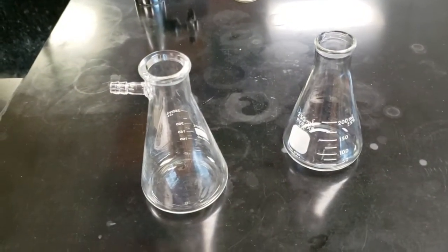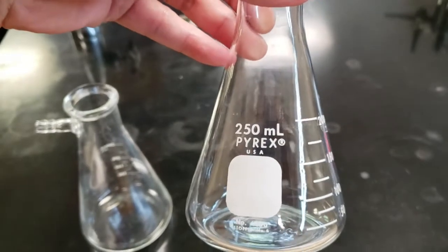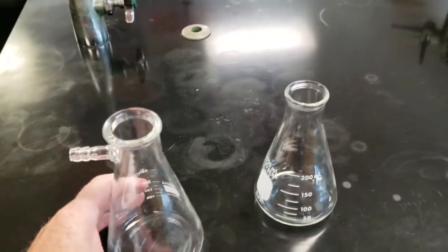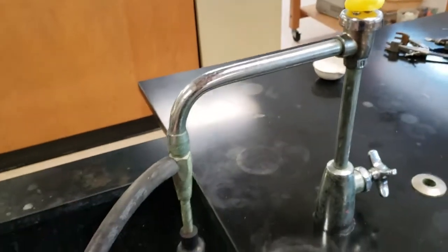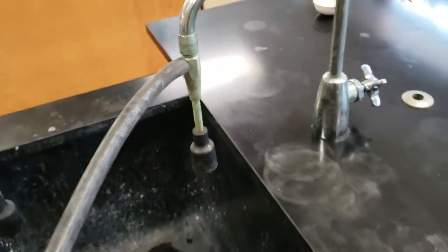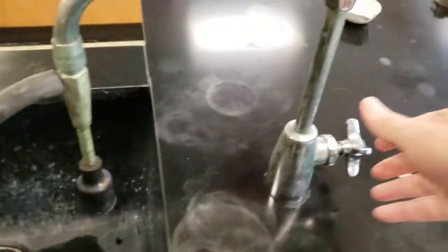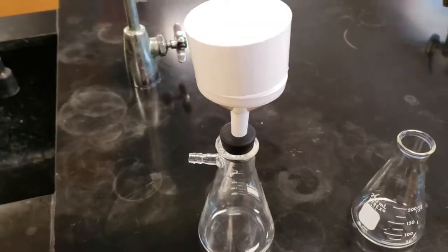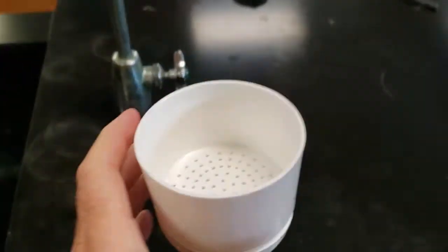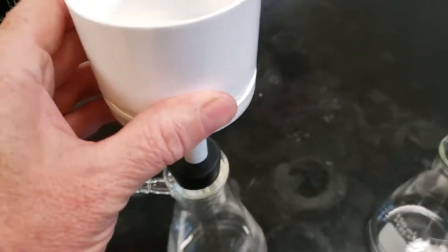These look alike, but they're not. The one on the right is an Erlenmeyer flask, spelled with four E's, also called a conical flask. It's a 250 here. This one is called a filter flask. It looks pretty much like an Erlenmeyer flask, but there's a glass spigot off to the side, which can plug into this rubber hose attached to the faucet. Once you attach it and turn the water on, it causes a vacuum inside the glassware. And then the top will be a filter. So this is a plastic filter for it. The filter lays flat, and it needs to be the same size as that. Once you pour your solids in there, the liquid will come out the bottom and the solid will stay in the filter.